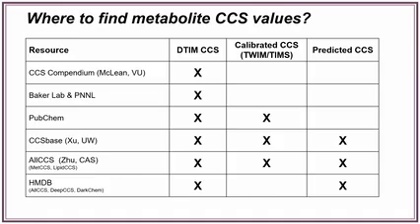It's a really great tool. And so that one's called All CCS. And you may have seen there have been some previous versions of this, Met CCS and Lipid CCS. I think they're all combined now together into this All CCS tool.